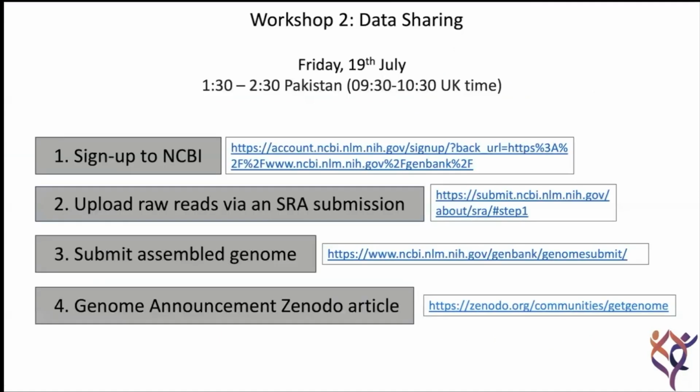You can see that we've been very reliant on NCBI, on the existing literature and bank of 16S sequences. And it is only from researchers like yourselves that these resources exist, and we wouldn't be able to do any of this work without having those resources available to us to recreate these trees and to align various sequences together.